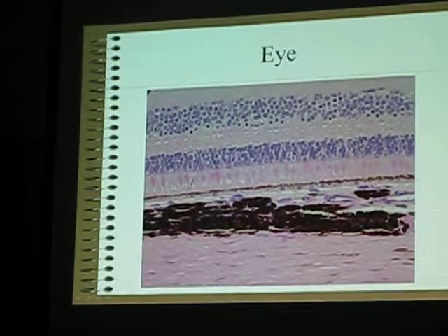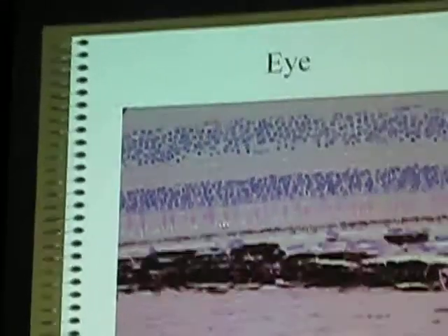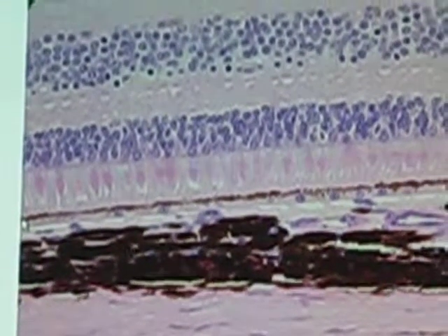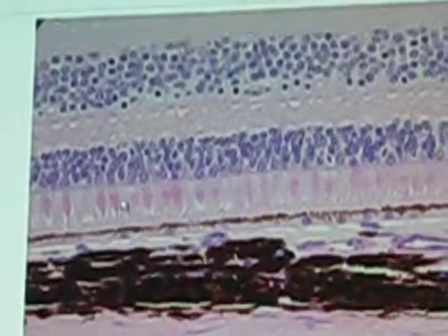See how they're kind of cup shaped here? Here and here and here, and they're a little darker pink. The straight, lighter pink ones in between are the rods. So if you look close up, you can definitely tell the difference between a cone, like these two right here, and the rod right next to it.